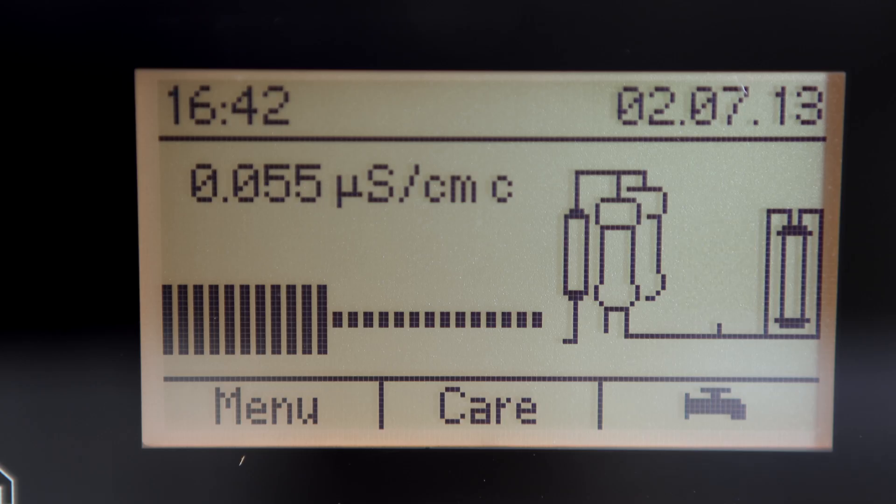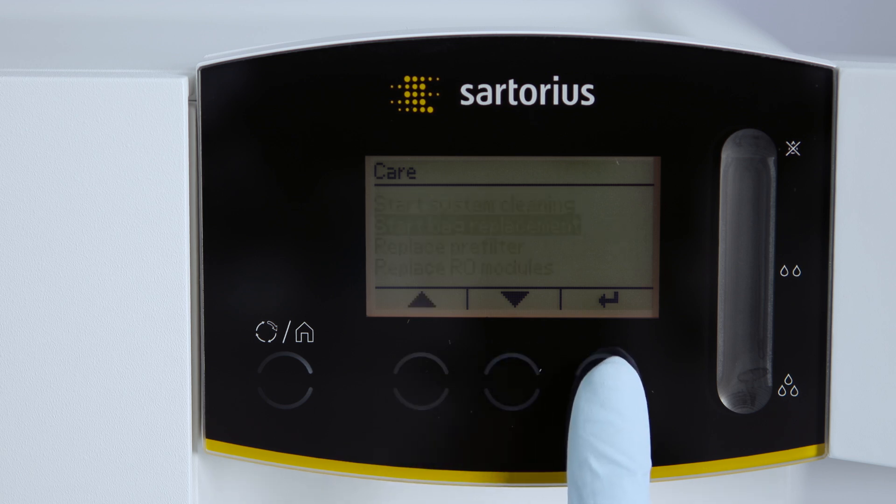With this innovative menu navigation, processes like cleaning become effortless tasks.